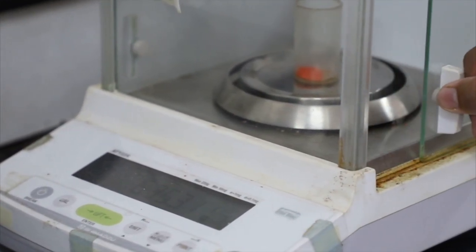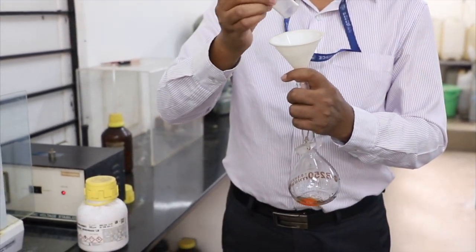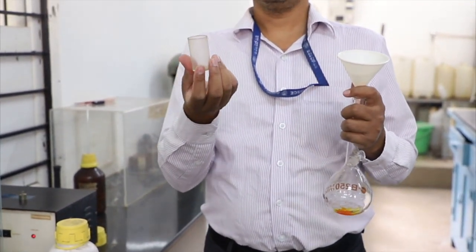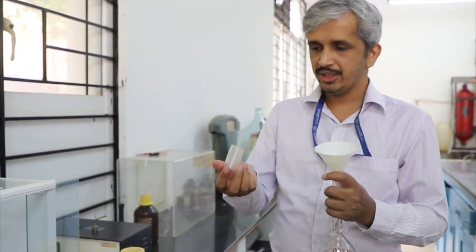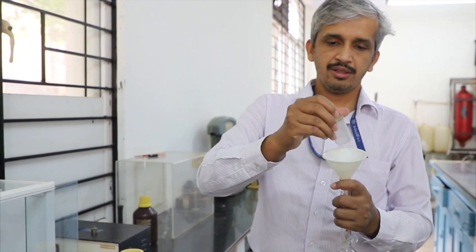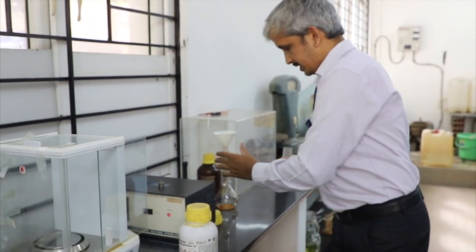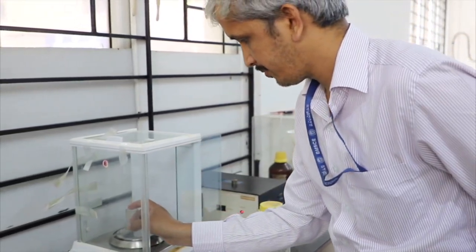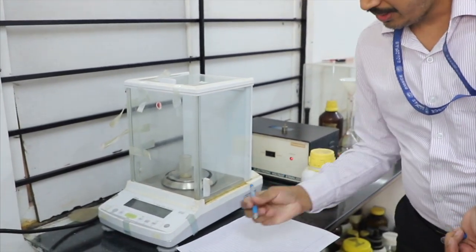What I am going to do now is to transfer this potassium dichromate inside the standard flask. Care should be taken that you should not touch this weighing balance with wet hands. If you touch with wet hands, then there will be alteration of weight. Therefore, the hand should be dry when you are weighing. So now I have transferred this potassium dichromate inside and keep this aside. I will just reweigh this empty bottle.